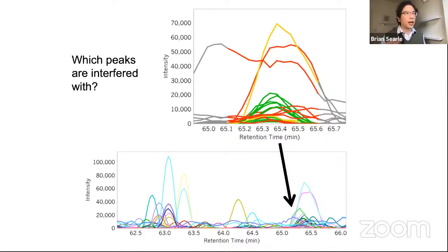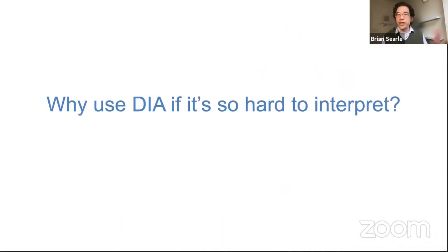So Bowen, we're going to talk quite a bit about library generation in a bit. Realistically, this DIA data is extremely hard to interpret when you're thinking about it this way, this sort of naive way of trying to extract out the data. So we have a bunch of new approaches that we're going to get to for how we're going to extract this type of data out.